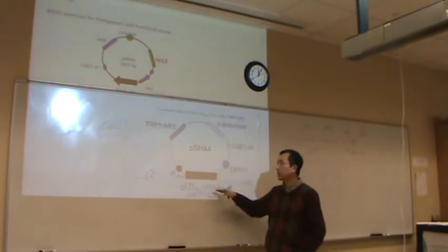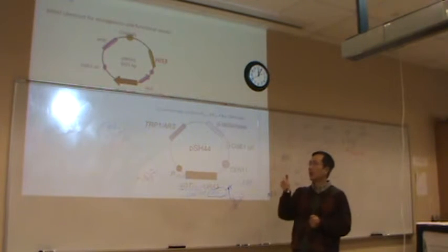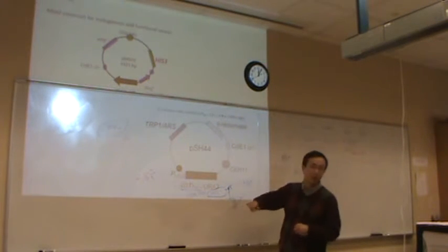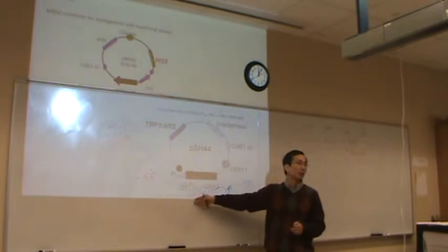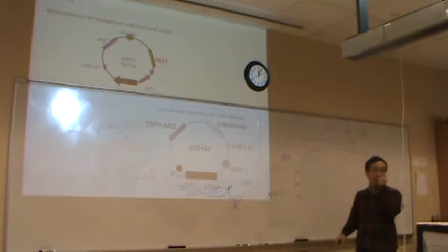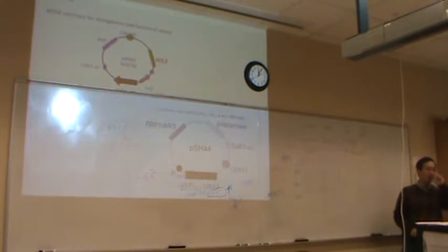We want to turn on the URA3. And the URA3 is like the light, the signal to indicate how well the MSH2 protein is going to repair the mismatch due to the microsatellite in front of it. The FOA is used as the actual final selection.